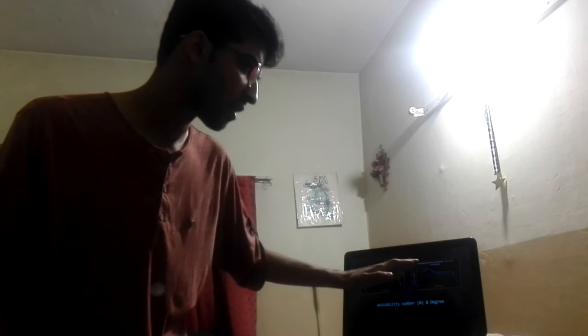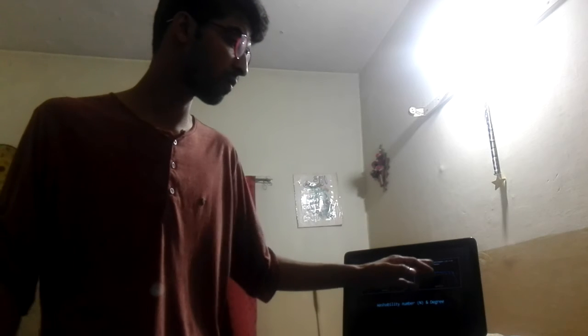Let's move to the next slide, washability number and degree. This curve is drawn between the specific gravity and the degree of washability. This curve is for minus 6.3 plus 1 millimeter, and this one is for the minus 1 plus 0.15 millimeter fractions. The next slide is the index of washability. The left one is for the minus 1 plus 0.15 millimeter fraction, and the right one is for the minus 6.35 plus 1 millimeter fractions. All of these curves are drawn from the calculations done after the results and discussion.